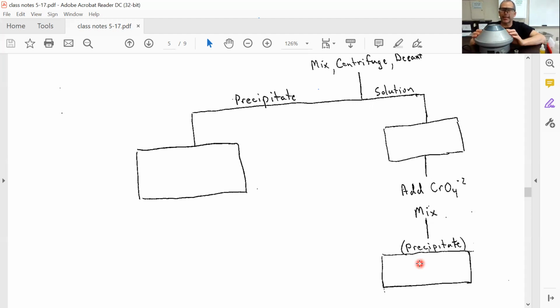So that's spinning, and again, the heavier stuff goes to the outside, which is the precipitate. It's at an angle, so that's why you see it coming out at an angle. And I don't know if that was long enough. Slow this up, and let's see what we have. We have our blank, and there is the precipitate stuck down on the bottom there in a yellow solution. It's a whitish yellow precipitate. On the bottom would be that barium chromate right there. And we saw how cloudy it was when it went in there. So that would be our separation of things.